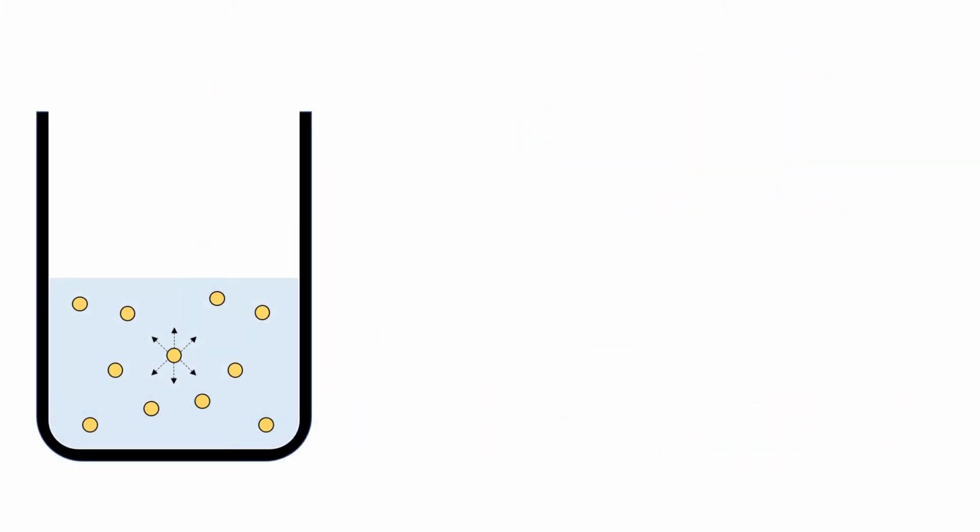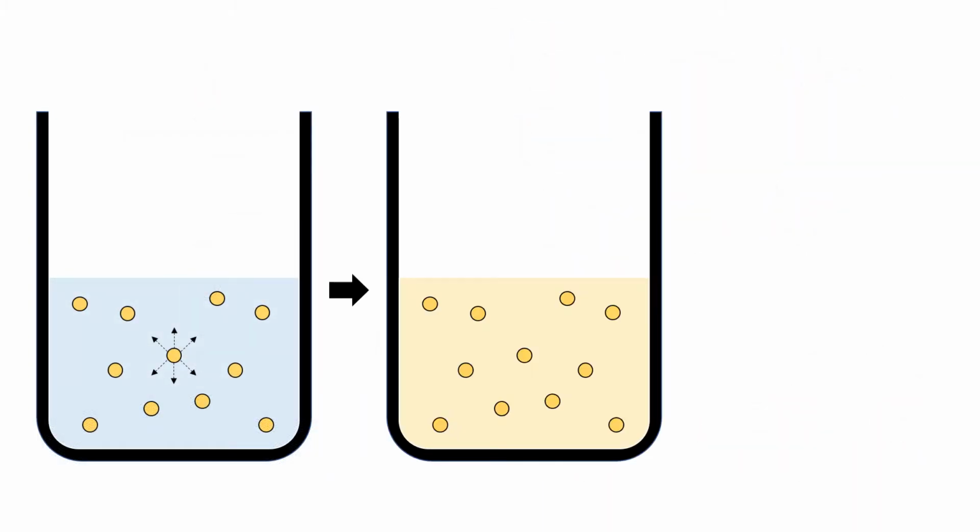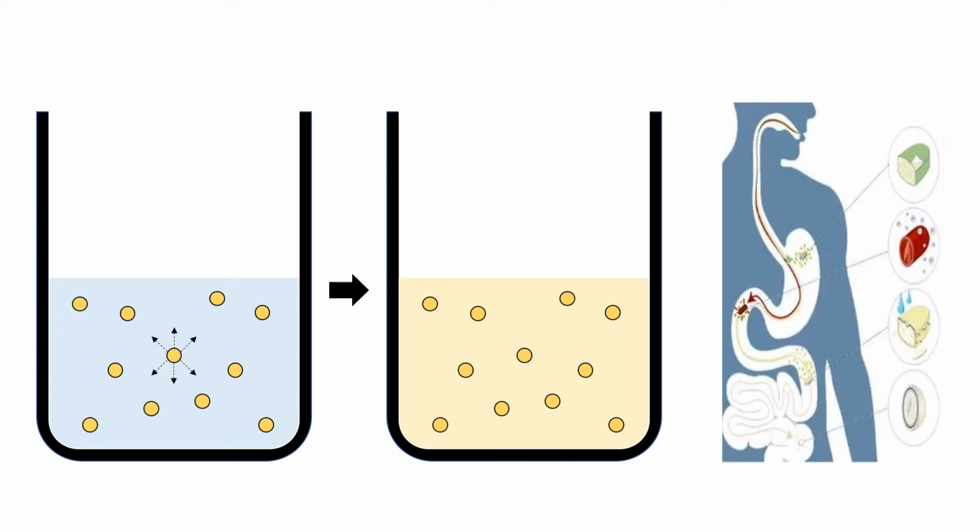The alginate beads cross-linked with the dye tartrazine were placed into a beaker of water and stirred such that the tartrazine would diffuse from the beads into the water. This diffusion was monitored by measuring the amount of dye in the water via spectrophotometry. This system simulates the release of a drug cross-linked with alginate in the body.